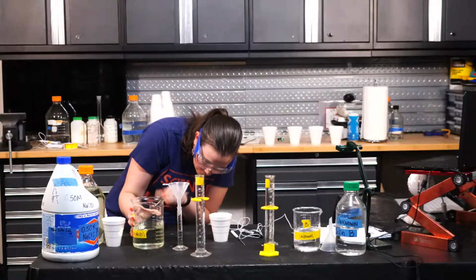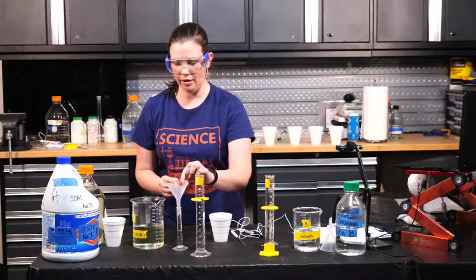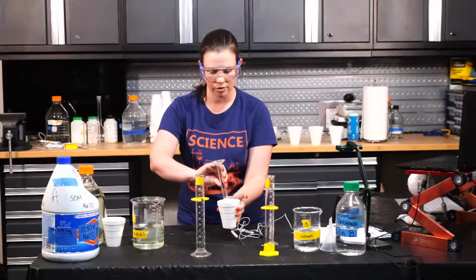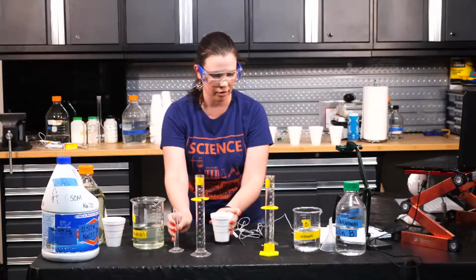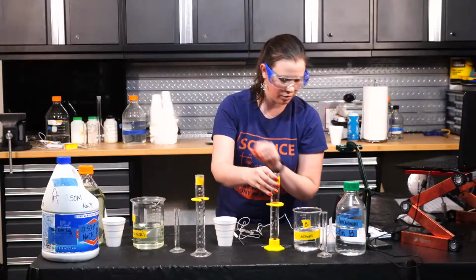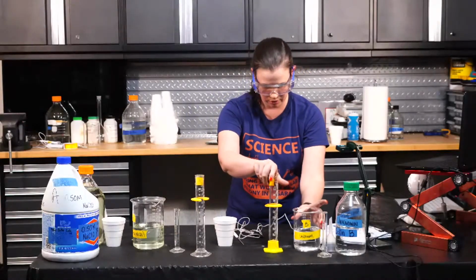All right. Whew, just barely. So there's my 5 milliliters of bleach. There's barely anything in there. And then we're going to go to 45 milliliters of solution B.